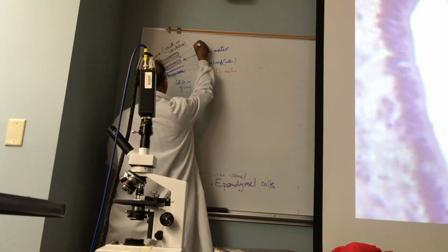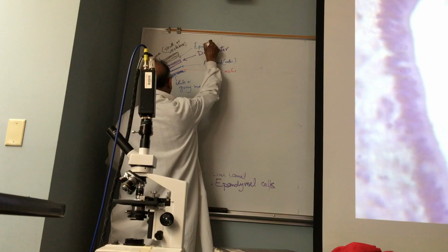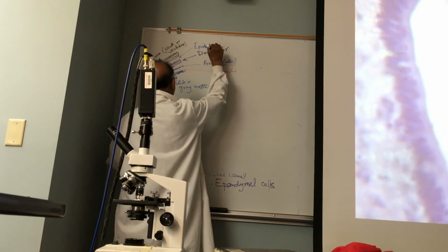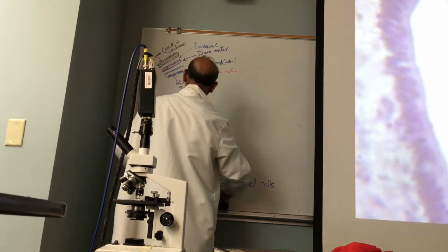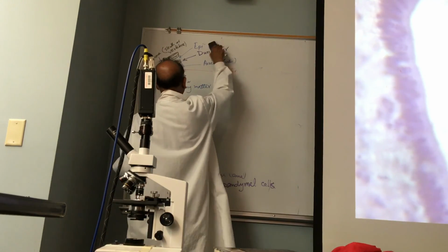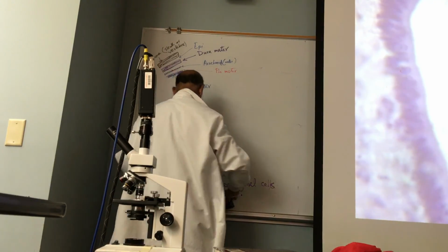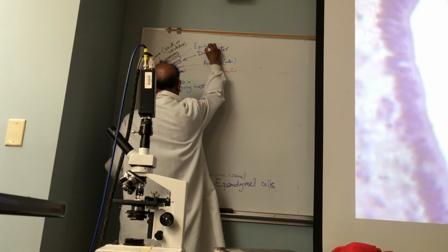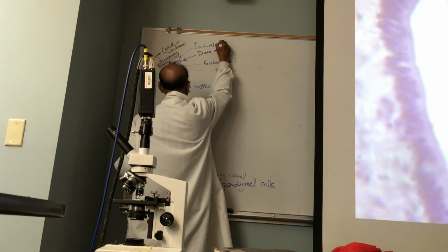This space is called epidural. My handwriting is going banana. Epidural space.